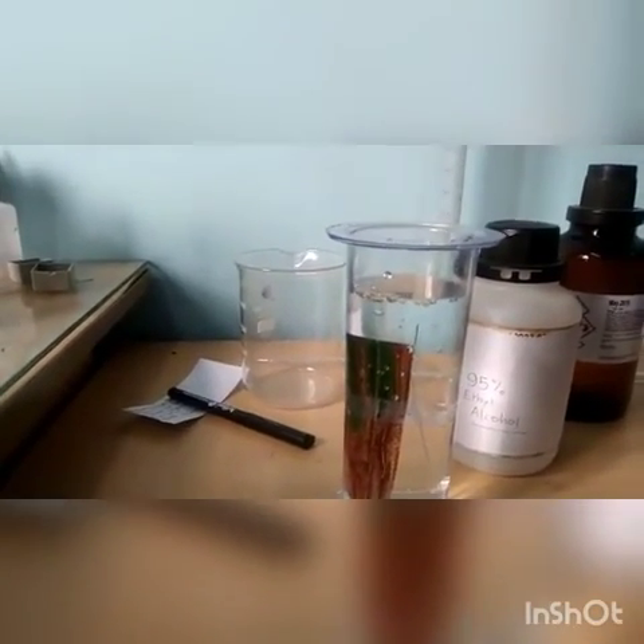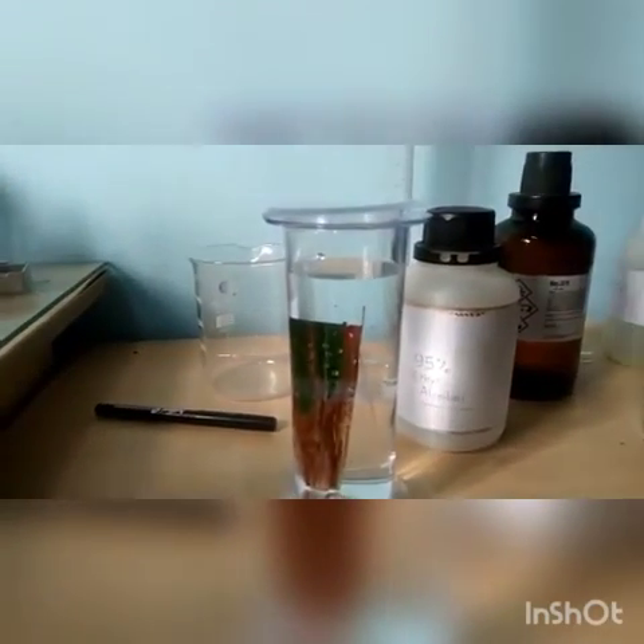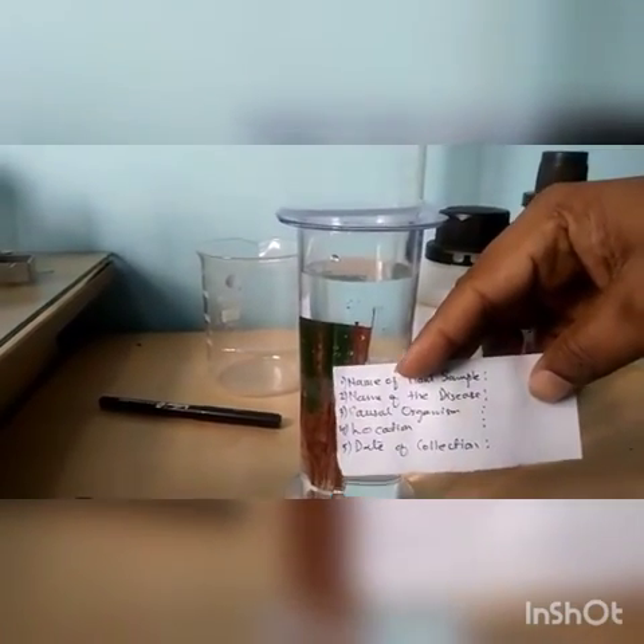Lids have to be closed and proper labeling has to be done, depicting the name of the plant sample, name of the disease, causal organism, location, and date of collection.